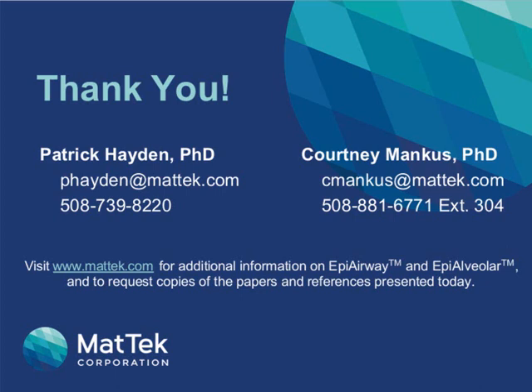We've got questions coming in so fast I'm having trouble keeping up with them, but I'll do my best. How does data produced with EpiAirway correlate with data produced from in vivo systems? So there are a number of published reports from EpiAirway users that have provided some very promising examples of in vivo correlations, including the prediction of nasal drug delivery and irritation. For example, the publication from MatTek that Courtney presented. The cigarette toxicity work that's been done by Philip Morris and others also showed a nice correlation to what has been previously obtained in vivo.